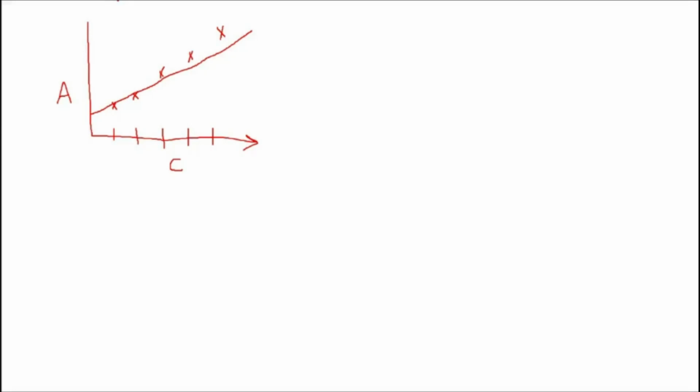Okay, so this current reading, we have errors in them. So we are going to find the equation of best fit line, using available values of different concentrations like C1, C2, C3, C4 and C5.